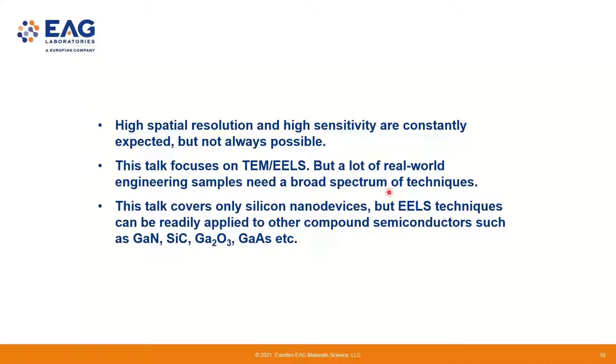For technological development, you really need high resolution, high sensitivity for the analysis, right? For this talk, I only focus on a very, very narrow but also very powerful technique, STEM-EELS. But in reality, a lot of the real-world engineering problems really need a very broad spectrum of techniques for either chemistry or composition or dopant analysis.